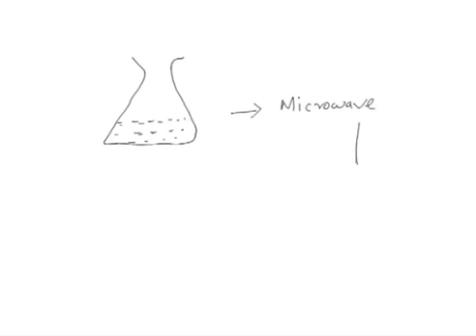Once you put it in the microwave, the agarose will melt and mix properly, and you will see a thick melted solution. Now, after that you cool it for a while, and then you can add ethidium bromide. Now, you will have a gel apparatus. This gel apparatus is enclosed on two sides, it is a glass strip with two enclosed sides, and the other sides you can tape. So, when you tape it from both sides, it will be enclosed from all sides.